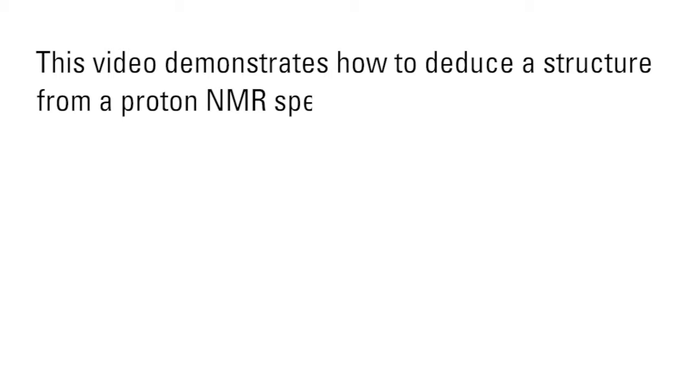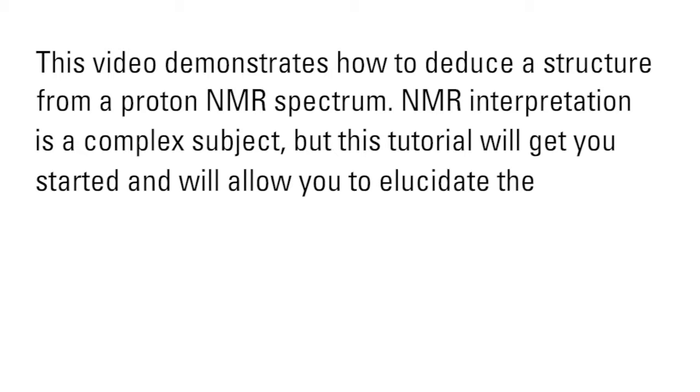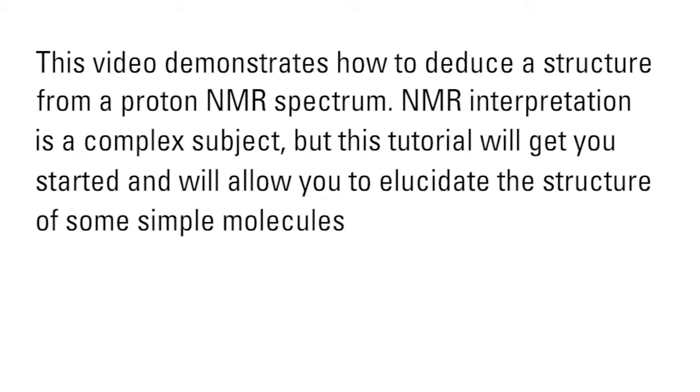This video demonstrates how to deduce a structure from a proton NMR spectrum. NMR interpretation is a complex subject, but this tutorial will get you started and will allow you to elucidate the structure of some simple molecules.